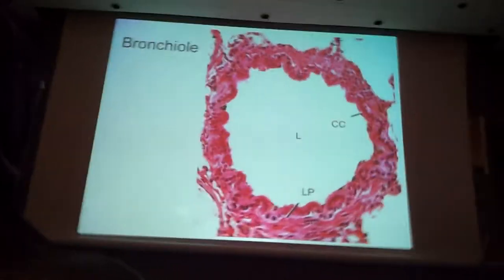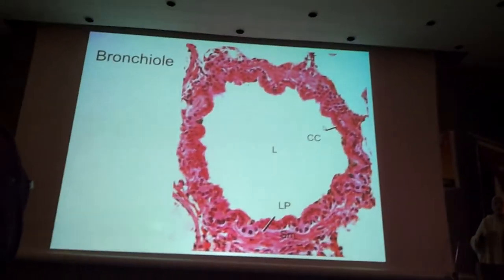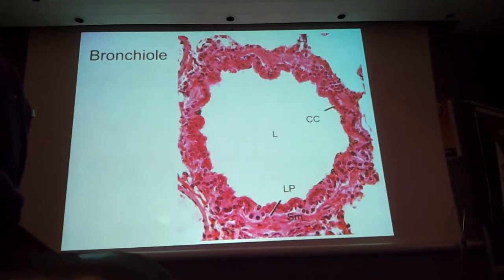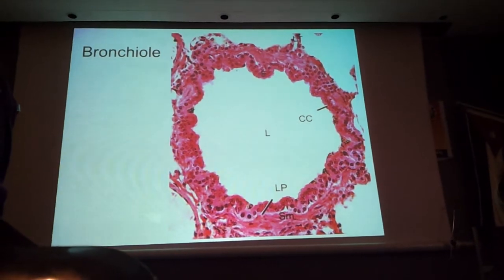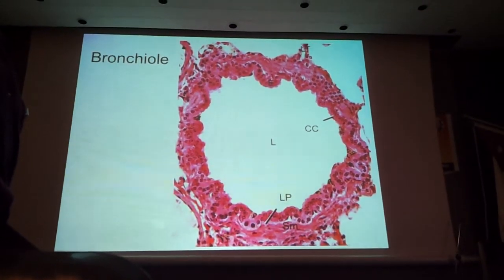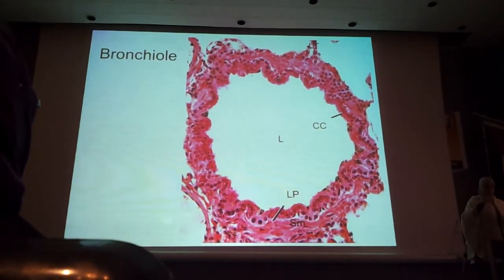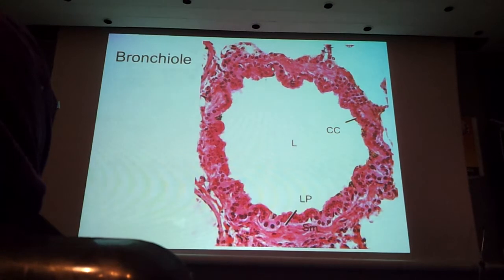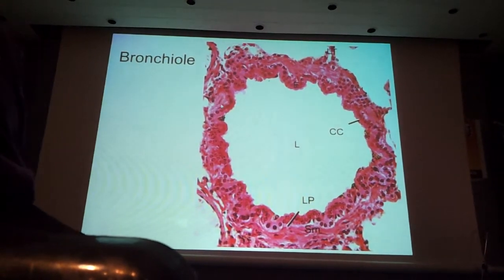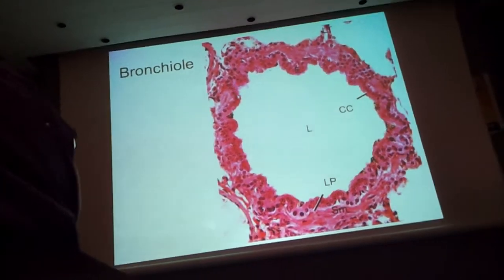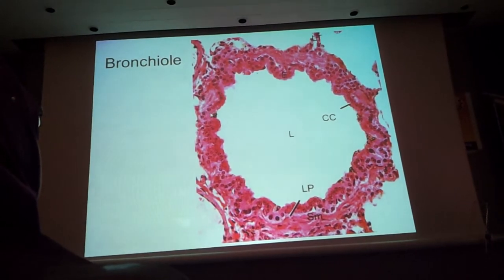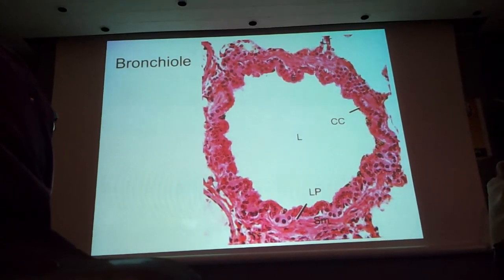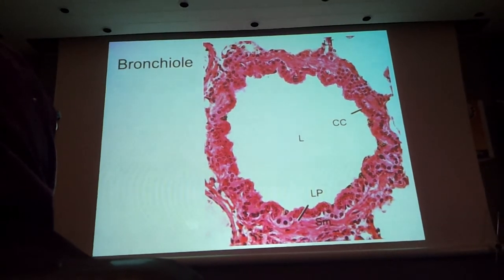Bronchioles may not have cartilage in their walls. As you go distally in the respiratory system, cartilage decreases and is replaced by an increasing amount of smooth muscle, and the thickness of the epithelium decreases. Here is the bronchiole — here is the lumen — and this is the epithelium. You can see the thickness of the epithelium is much smaller. This is not pseudo-stratified ciliated columnar epithelium; you can see one level of nuclei, unlike pseudo-stratified ciliated columnar epithelium where you can see different levels.